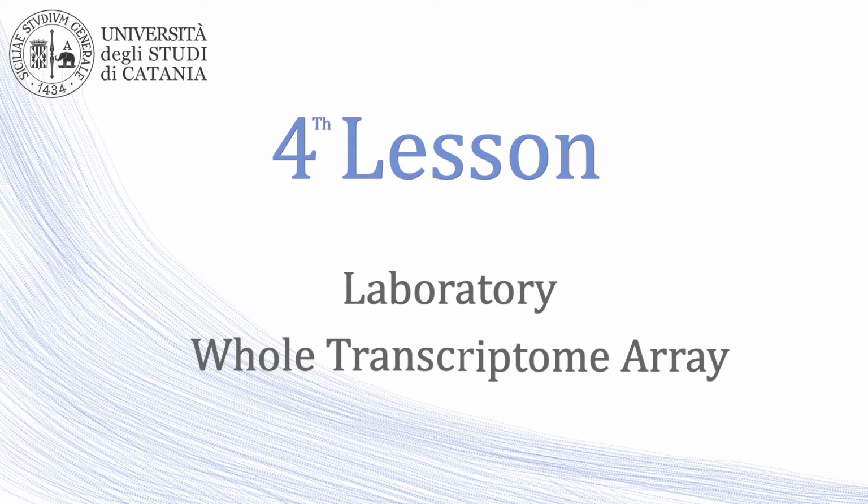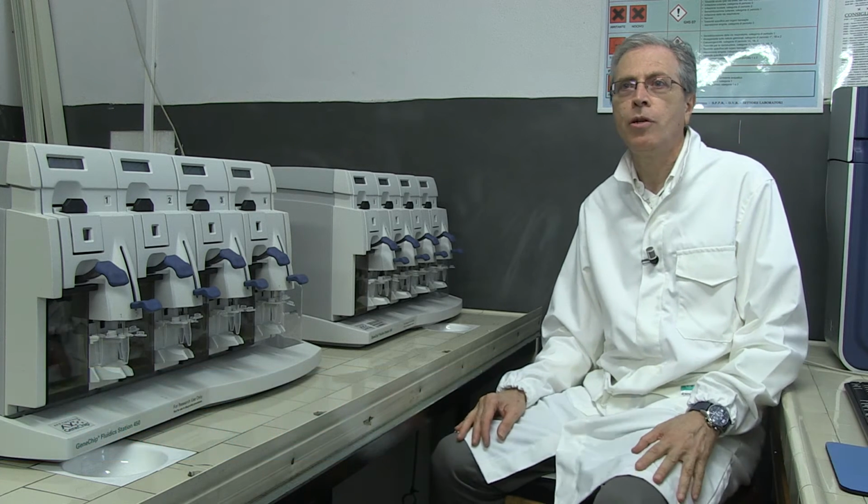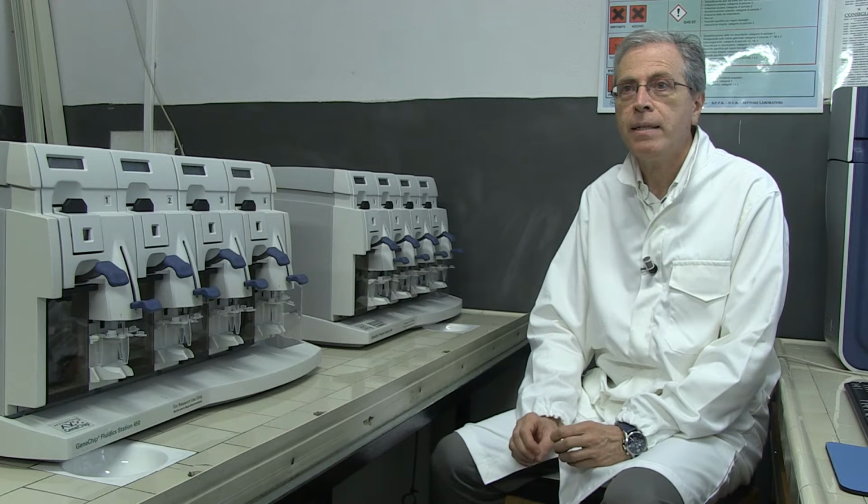Today, we will describe and show step by step the technical procedure used for analysis of RNA samples by hybridization on microarray. This is an example of a technology used in the field of transcriptomics and provides a quantitative determination of all messenger RNA and a large amount of non-coding RNA present in a biological sample.